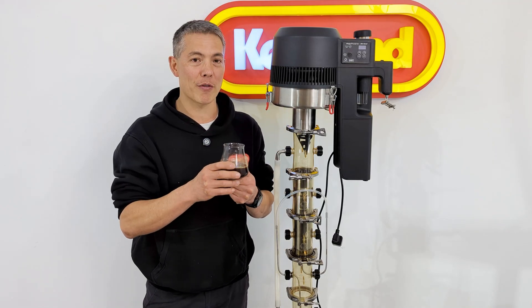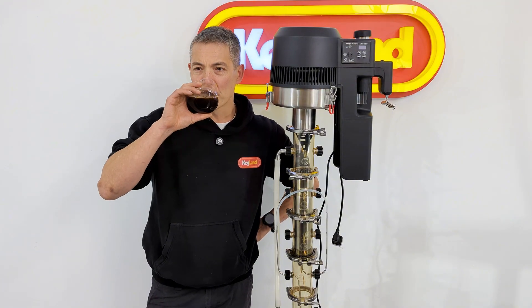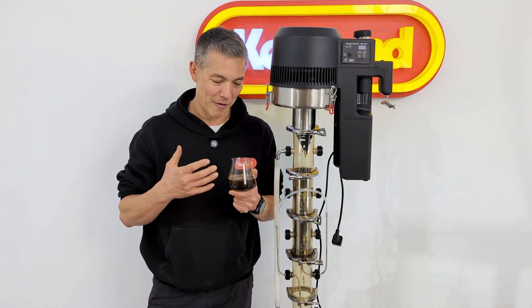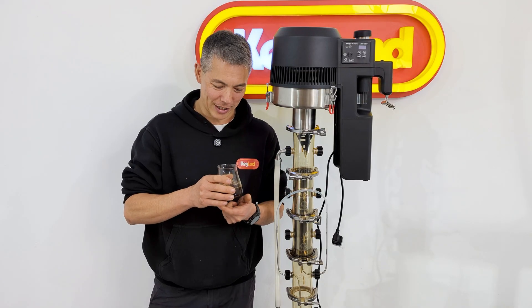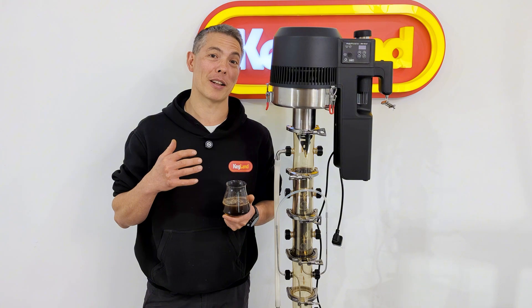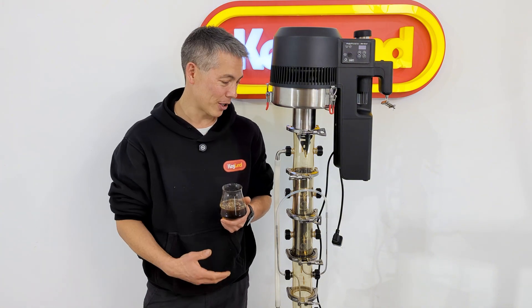I've got the liquid here from the boiler and it tastes really intense — sort of like an espresso coffee, maybe even slightly more aromatic. Obviously there's a lot of alcohol in there. I think it's a really interesting process. I'd be really keen to try this on something like hops — extracting the flavour out of hop flowers — that would be kind of cool.